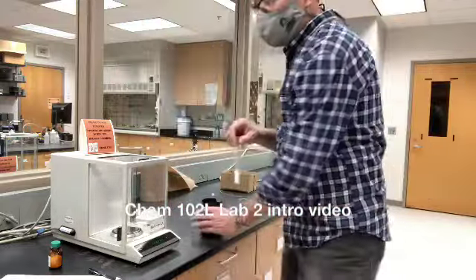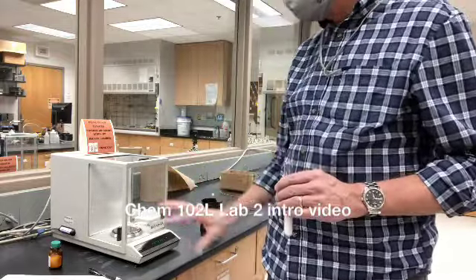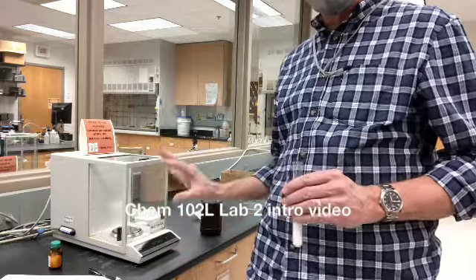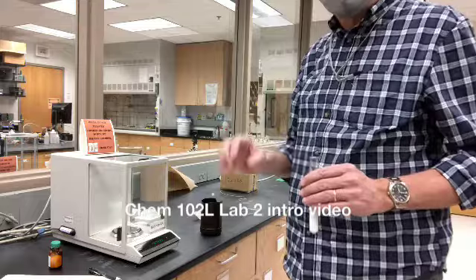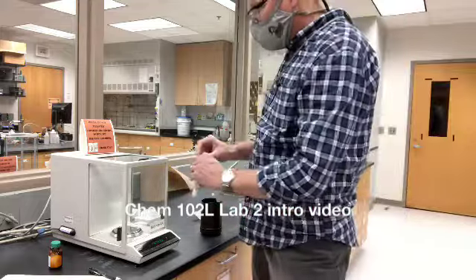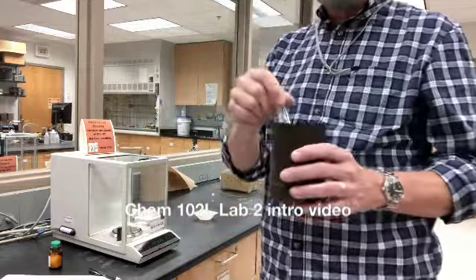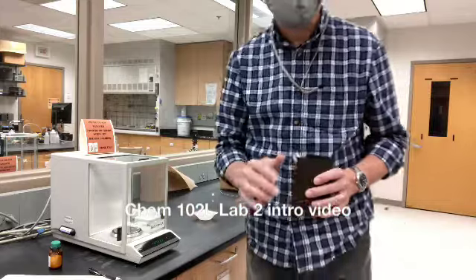And it's that easy. I'm not trying to fuss with the analytical balance to get close to 4. I'm using the top loading balance to know that I'm around 4. I don't need to write that number down because I'm going to transfer it to my test tube, and I've got an accurate measure that I write down for that mass.